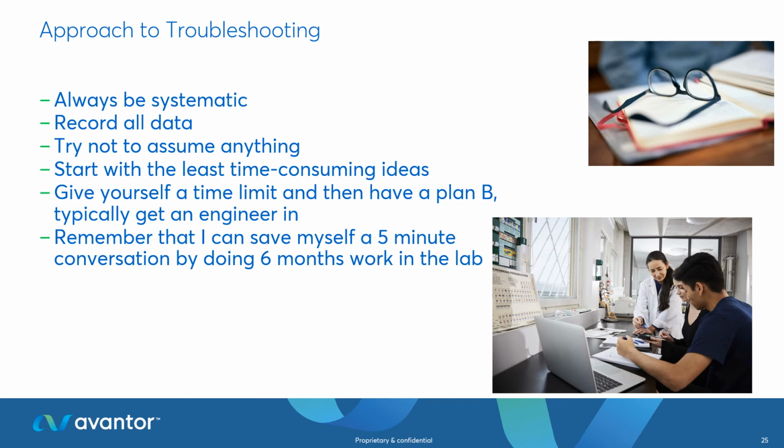Basically what he said was that I can save myself a 5-minute conversation by doing 6 months work in the lab, which clearly doesn't make sense, because why would we want to do 6 months work in the lab? But oftentimes as an individual, we won't be the first person to see a particular issue. So do talk to your colleagues to try and work out what actually is happening.